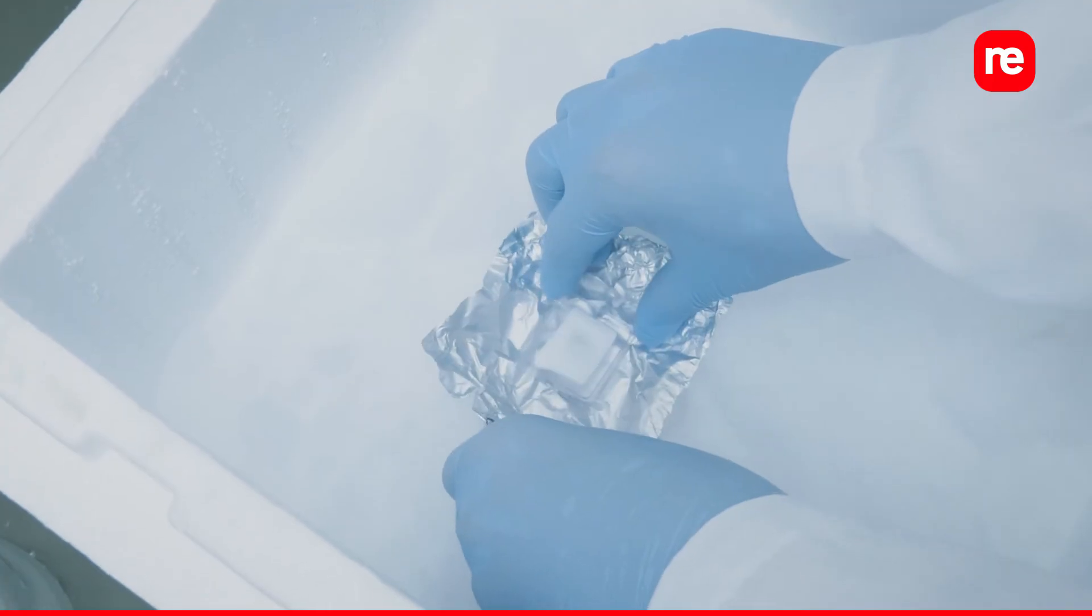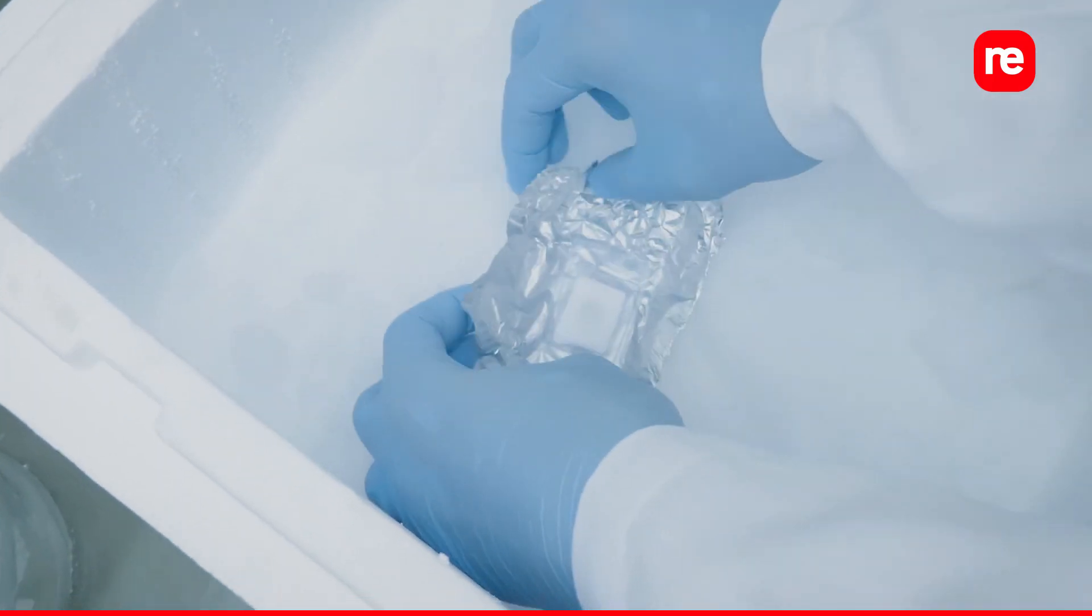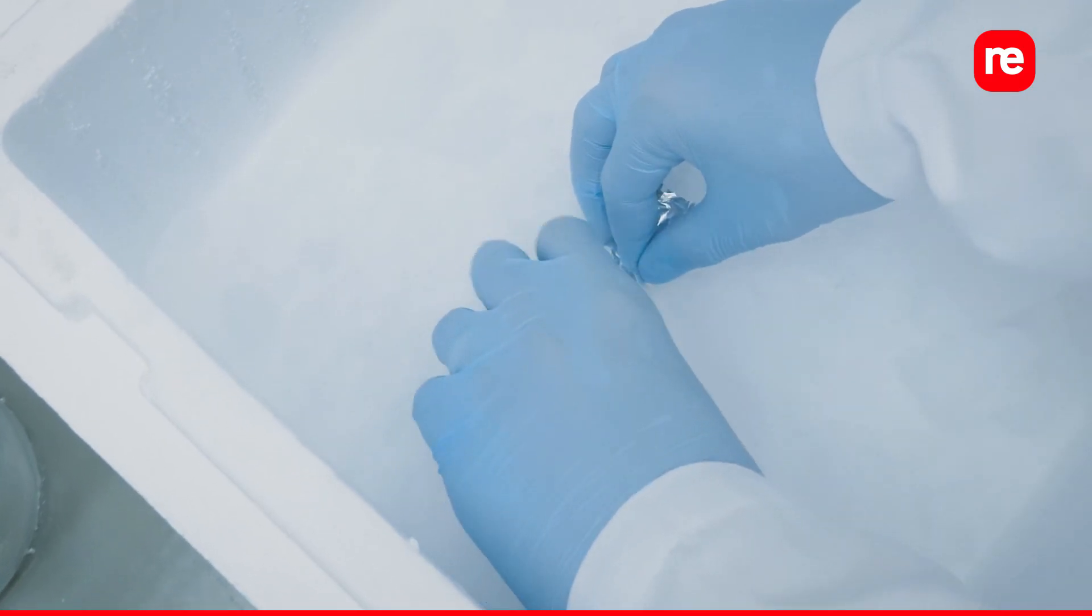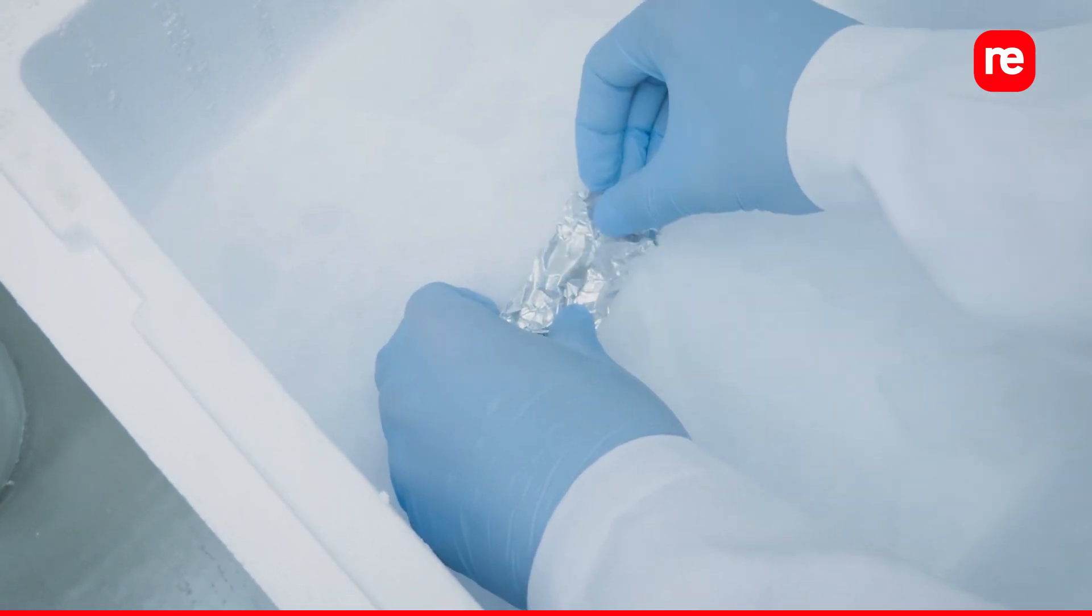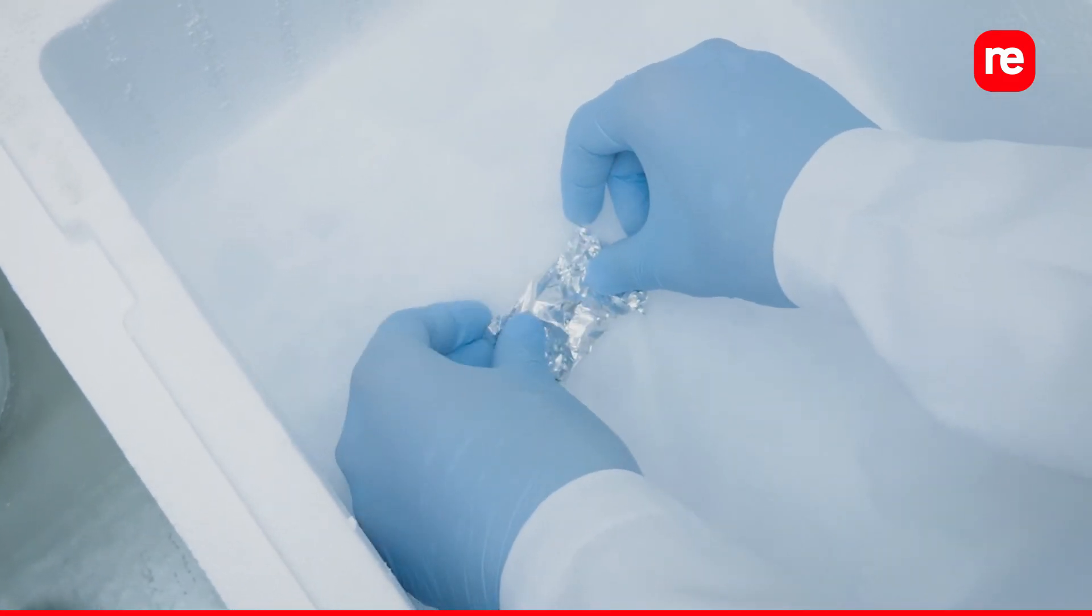Retrieve the cryomold and completely wrap it in a pre-cooled and labeled piece of aluminum foil. Store at minus 80 degrees Celsius until section.